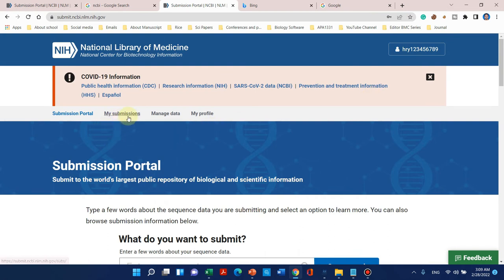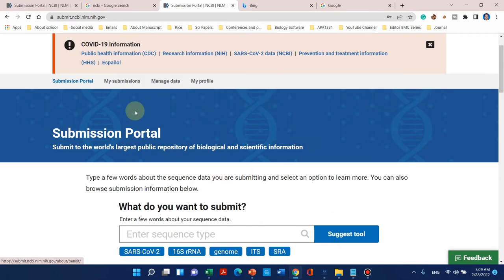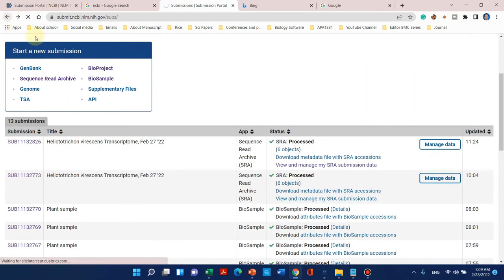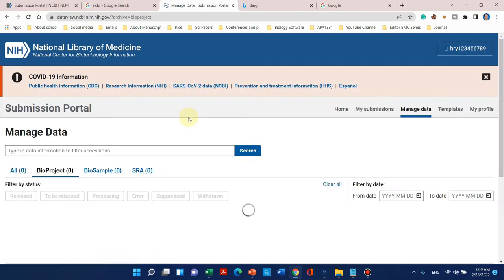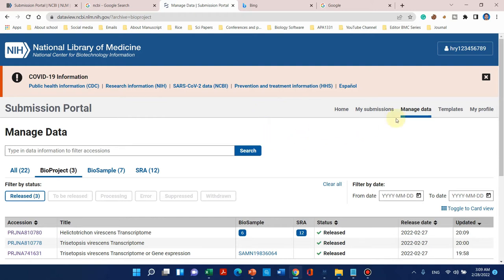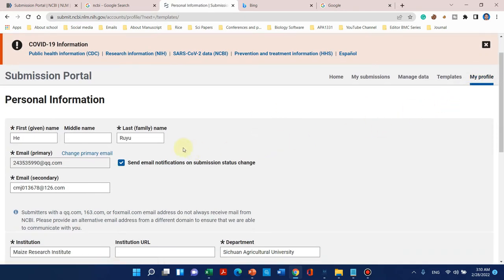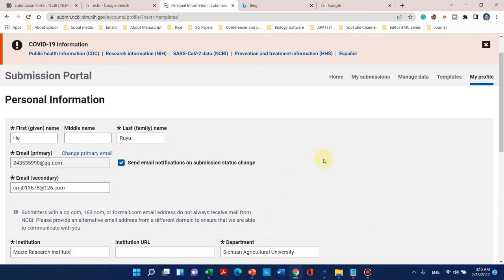Let me introduce this dashboard. Here is the submission portal — this is our home page. Here is 'My Submissions' showing what we have already done. Here is 'Manage Data,' a tab which can be used if your data is private and you want to share with any reviewer. The next tab is 'Template,' and the last one is 'My Profile.' I recommend you to save your profile because this information will be automatically retrieved at the next level.